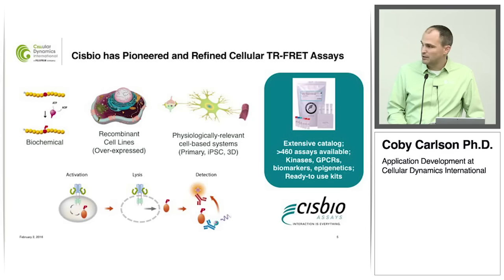And just a schematic on the bottom where anyone that's run a cell-based assay where you've got your cells in the plate, you stimulate them, you lyse them, and you detect. And it's homogeneous and it's robust, so we're really happy with this, and it's a fun technology to use when you're trying to answer some of these different questions.